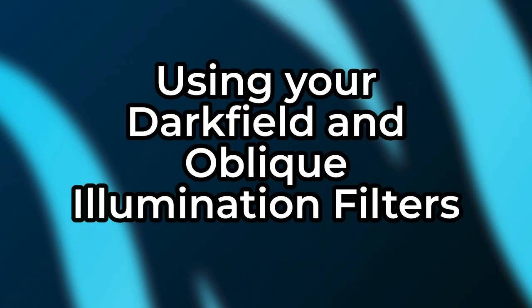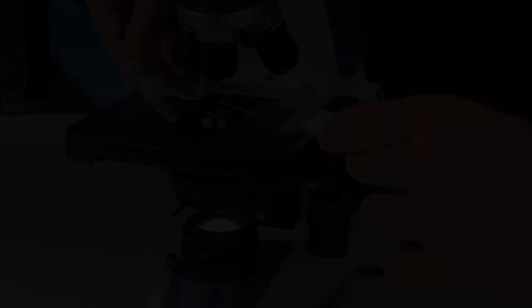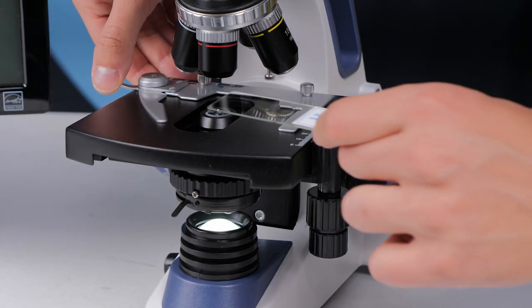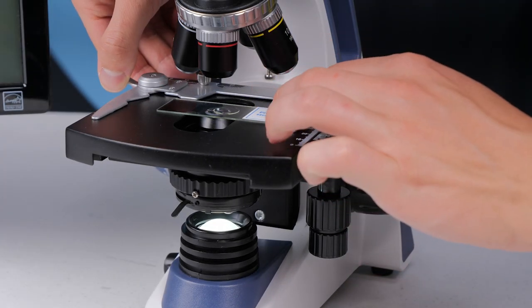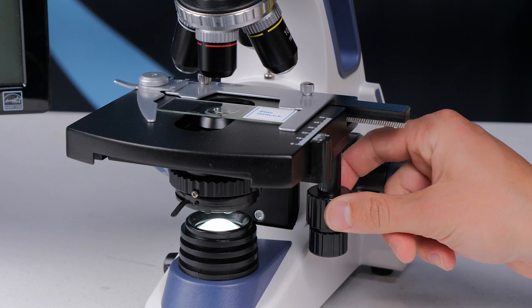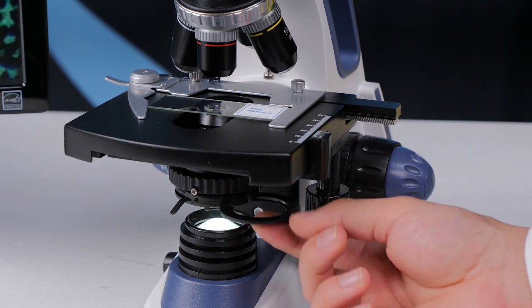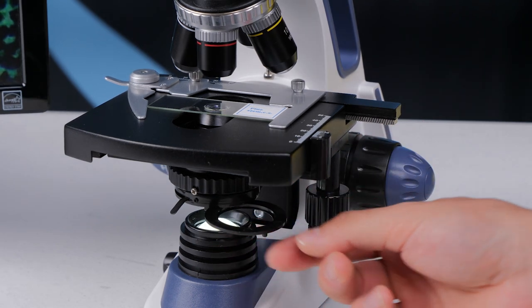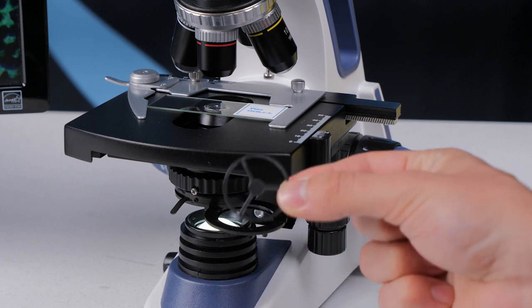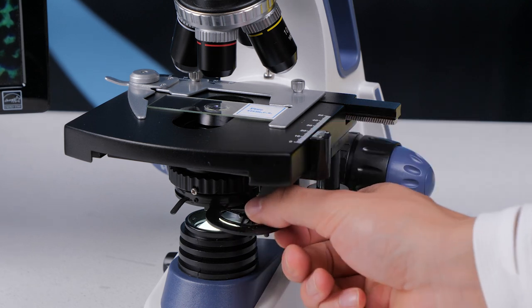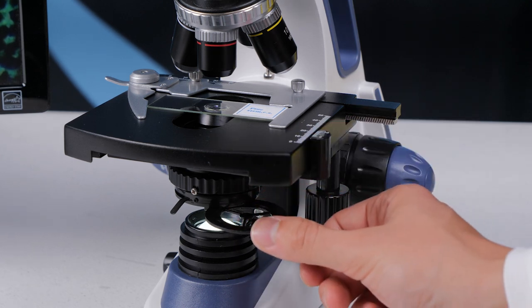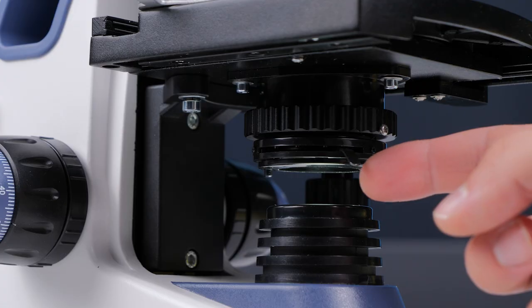Using your darkfield and oblique illumination filters. To change the microscope into darkfield mode start out with the standard transmitted light brightfield. I like to use prepared sample slides to get my darkfield setup aligned. Under the condenser is a filter holder. Place a darkfield filter in the holder and rotate it into the condenser light path. At first you won't see anything, you'll need to open up the condenser iris all the way.